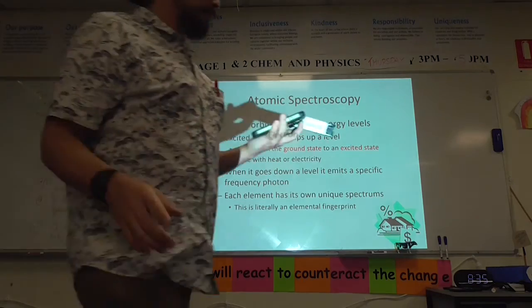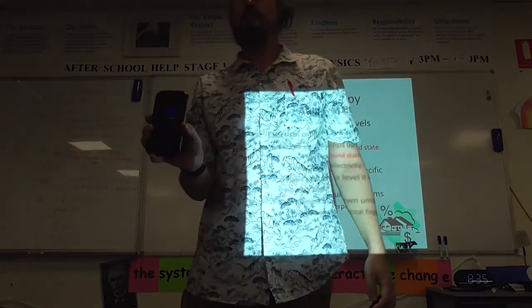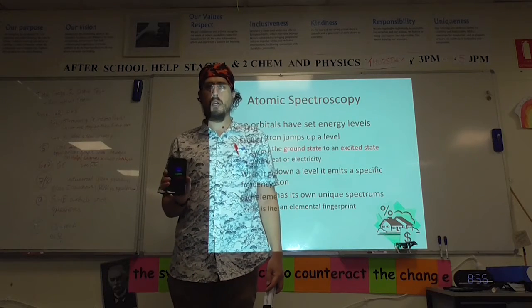Now that's these LED lights, but if I go out to this light here, which is a fluorescent tube full of gas, just give me a second. Can anyone else see it? All right, this one's different. You're not going rainbow. What do you see? Do you see a full continuous rainbow? No, you don't. You see lines.